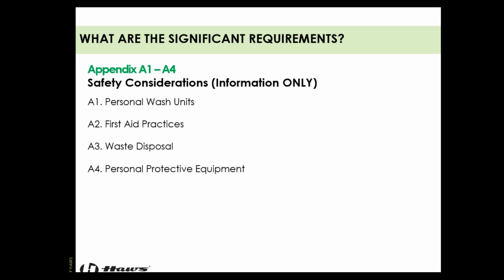If you have those squeeze bottles, which is what a personal wash is, or supplemental bottle, those are just meant for immediate treatment, not a full 15 minutes, and you need to have primary equipment nearby. A2 just notes that a physician or other appropriate safety professional should provide guidance on specific hazards and emergency eye wash shower equipment.